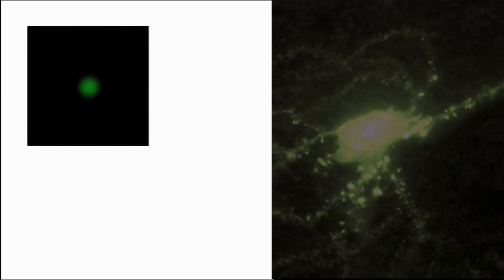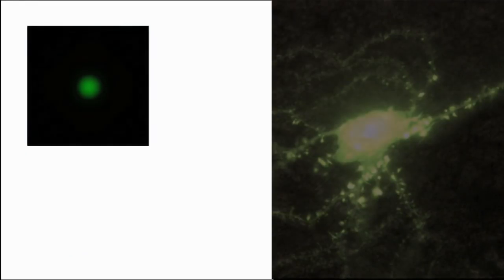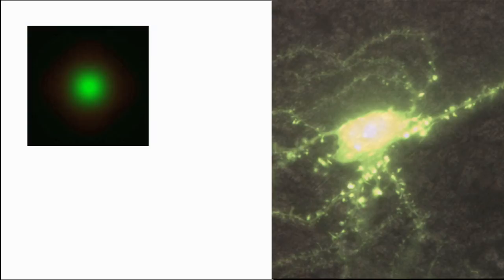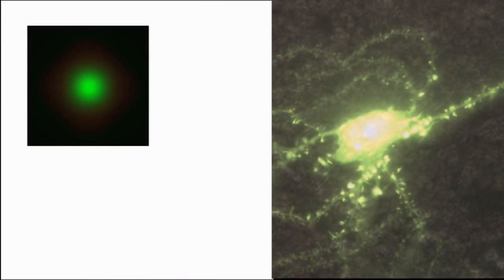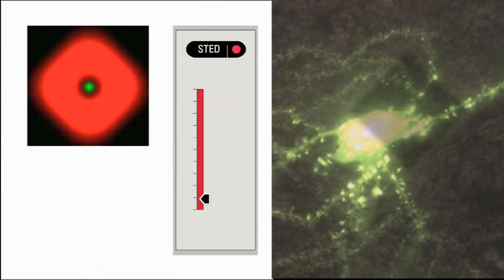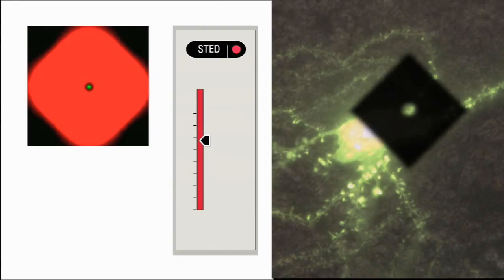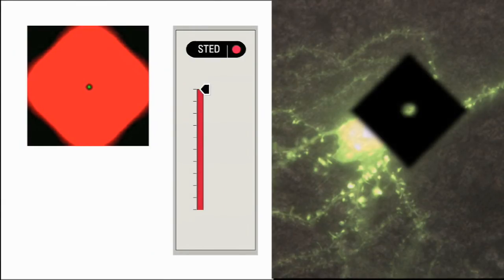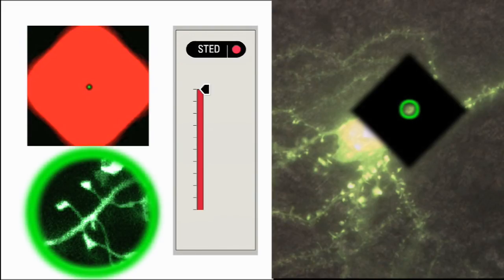As in regular fluorescence microscopes, a laser makes stained tissue like this neuron glow. The knack of the STED, a second laser, in this case red, works like an off switch. In a tiny aperture of the red laser, fluorescent green details remain, images beyond the resolution of a regular optical microscope.